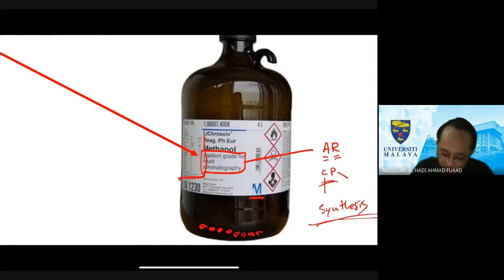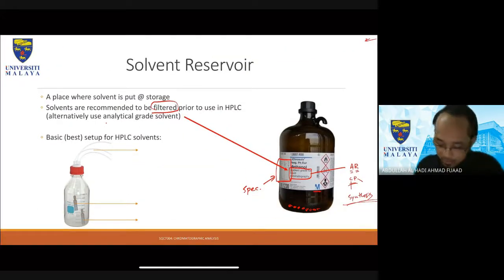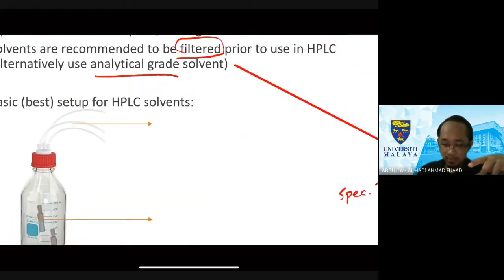So over there, it's not clear, but over there it's normally the spec for the solvent itself. Okay, all right, so analytical grade, as I mentioned. Now, for the reservoir itself, this is one of the available setups.